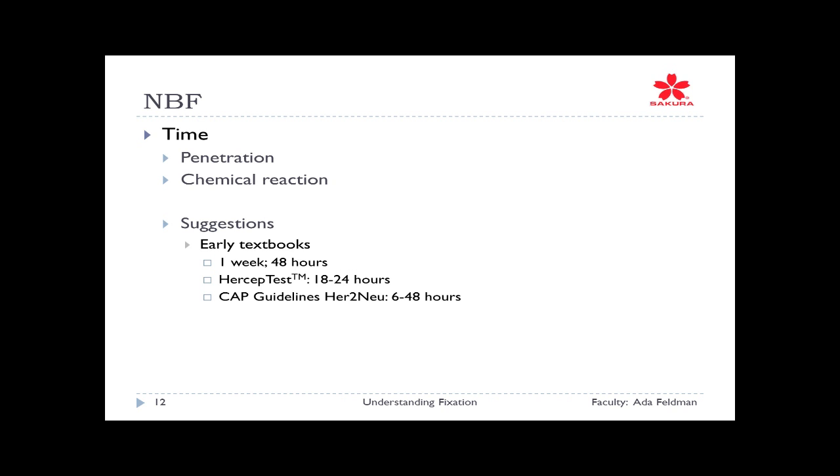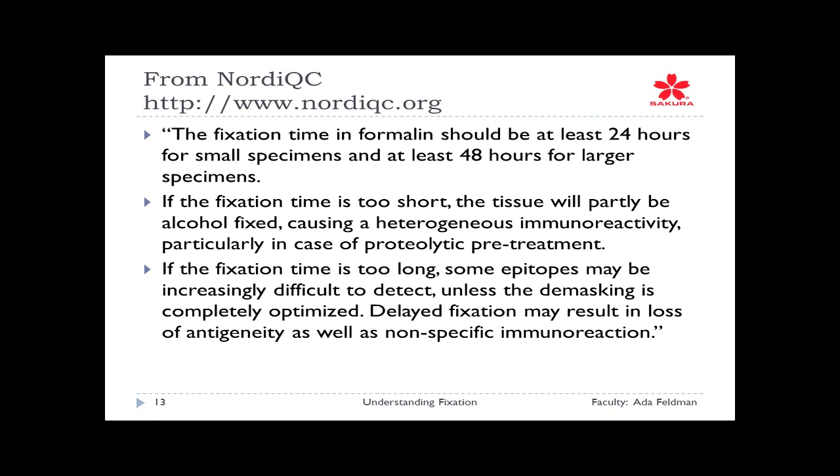But if you're following the CAP guidelines, there are times those breast biopsies are coming in and they may not even be given 6 hours. The reason why these companies and organizations are requiring these times is because they know you've got to give it proper time for the penetration and the chemical reaction. Otherwise, the base of the pyramid is going to be weak and what you see is going to be improper.